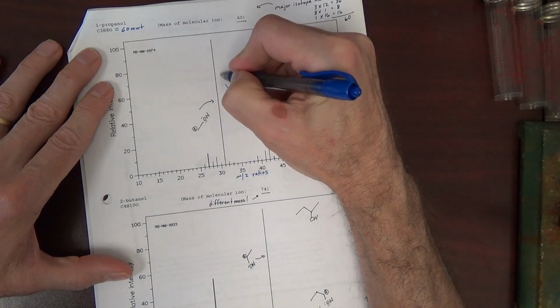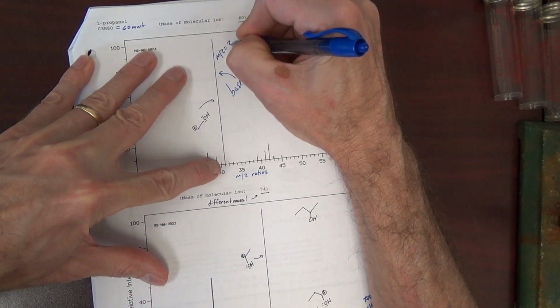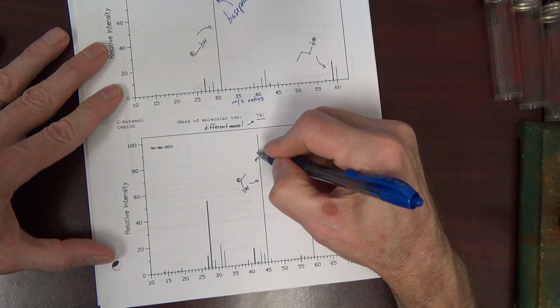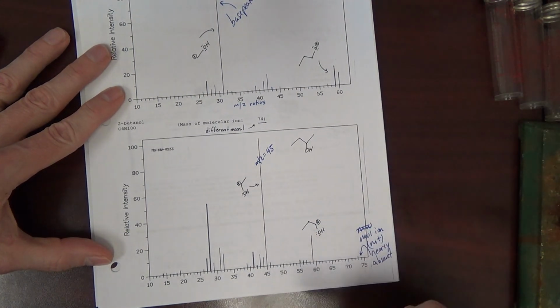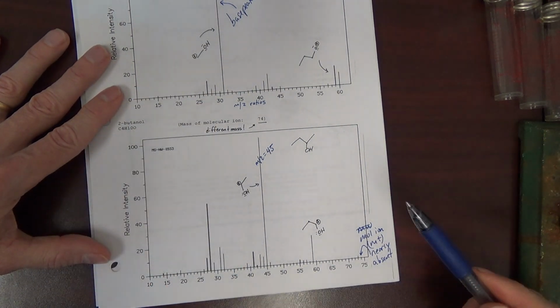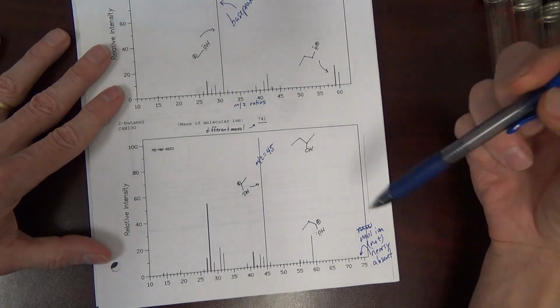And the base peak here is m/z equals 31. Where the base peak below is 45. And once we learn more about how to predict cleavage in mass spec, these base peaks will really help us know which alcohol goes with which mass spectrum.